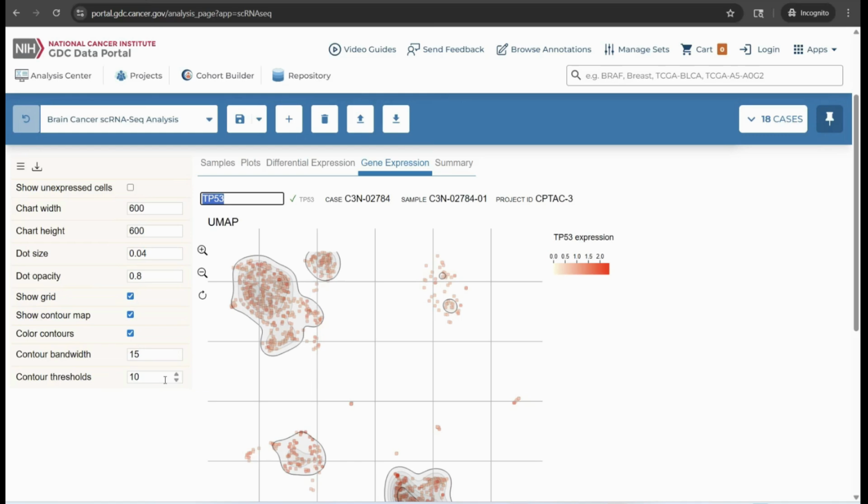There are a variety of analysis applications for visualizing gene expression in the contour map, such as population center detection, transition analysis, and rare population identification. Population centers can be detected when dense regions appear with concentrated contour lines. This reveals primary cluster locations and identifies population boundaries.